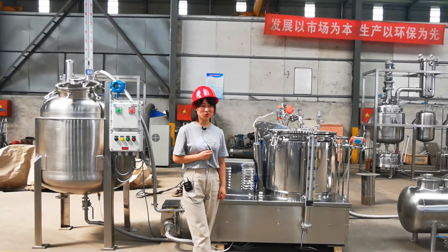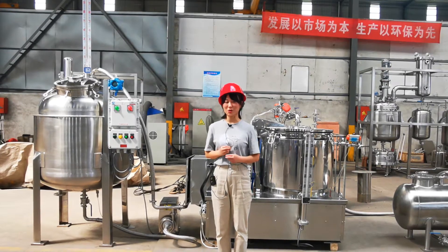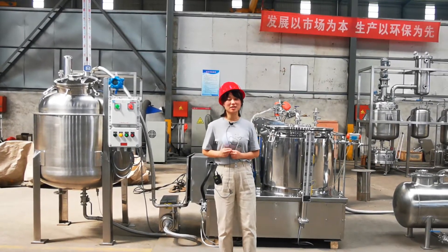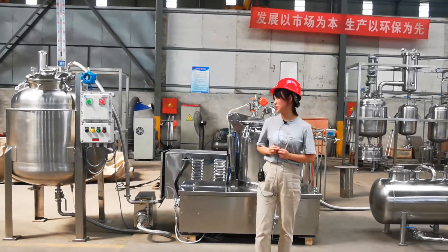Hello everyone, this is Chris from Comption. Today let me introduce our CBD oil distillation equipment complete solution.